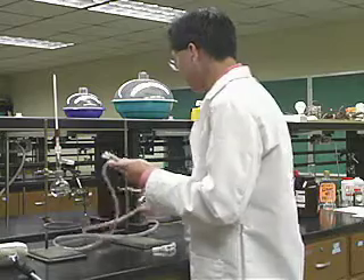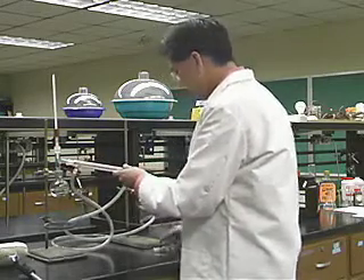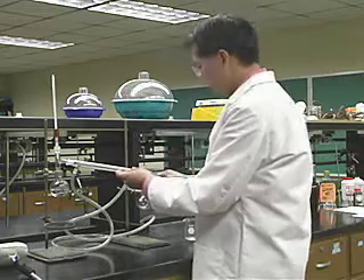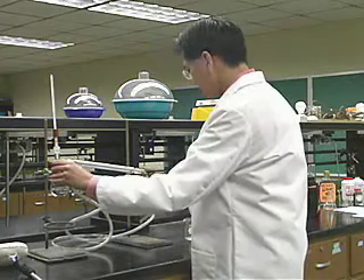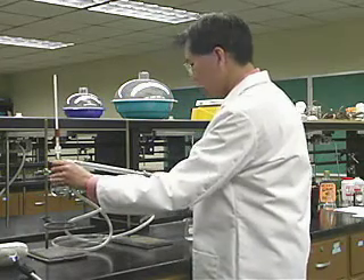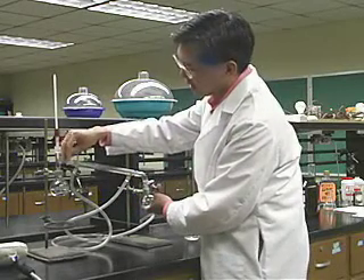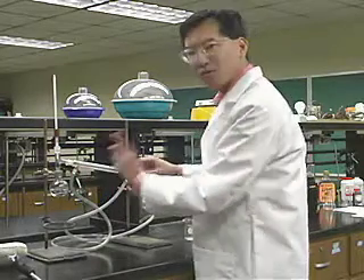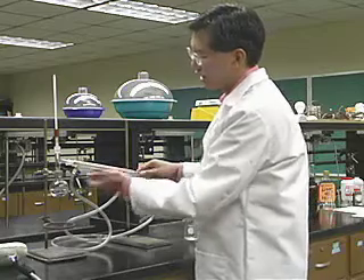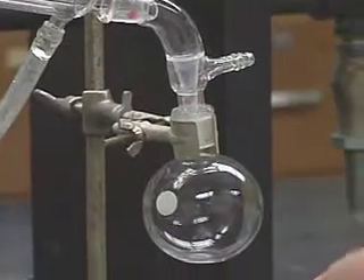We'll assemble that part, then another adapter, and down to our receiving flask. It sometimes takes a little adjustment to get everything working right. If you have clamps available — they make plastic clamps that clamp these joints together — that's a good idea. You can also grease the joints if the grease is not going to contaminate your material. If the grease is not soluble in your material, go ahead and grease the joints, but it's not really crucial — if everything is put together fairly tightly, it will be fine.